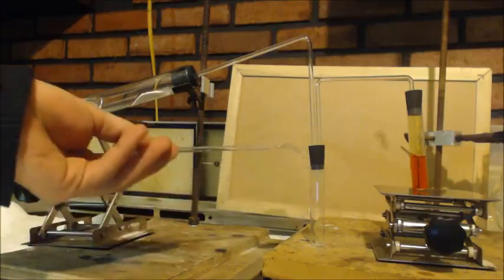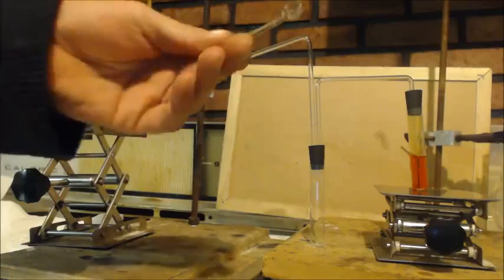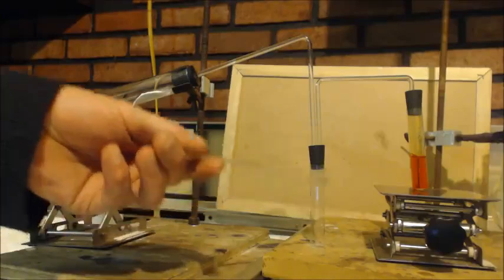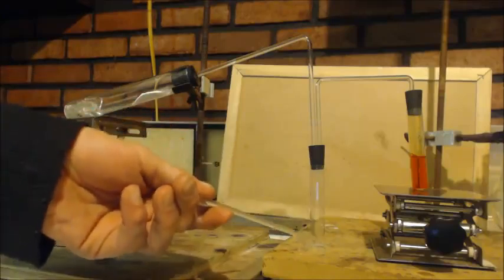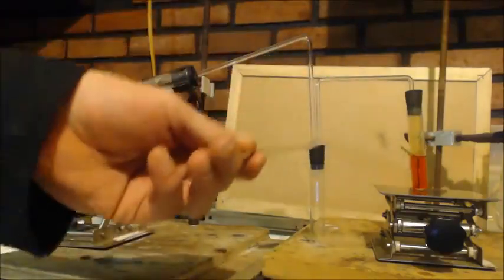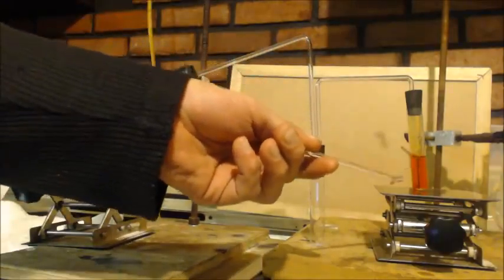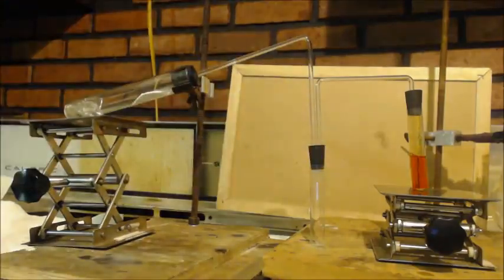But the empty container is because some ethanol is coming out, you know what I mean, liquid ethanol. And this will catch it. It'll come down here and condense, and only the propene can come, or only the ethene can come out this way to the next test tube, which has that bromine water in it, okay. Now bromine water, if this goes into that, it will make a halohydrin, okay. It'll decolorize that bromine.